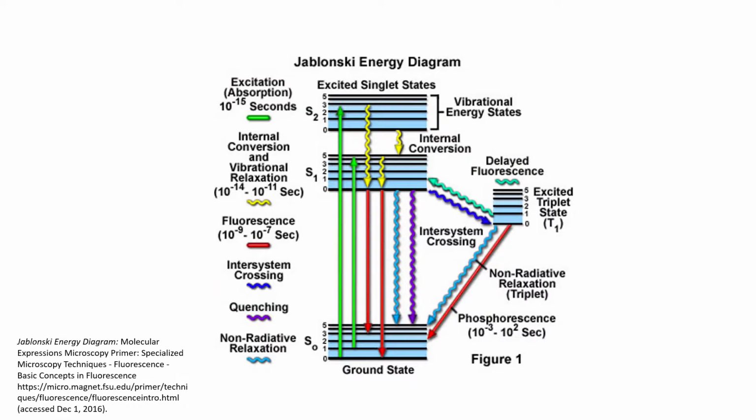A molecule's ability to fluoresce is a process of excitation and emission that occurs in 3 steps. We'll use a Jablonski energy diagram to walk through the process. The diagram is a representative figure of the electron activity during the excitation and emission steps. The first step is the excitation of a molecule by an incoming photon. This means the electrons are excited from the ground state to higher excited energy states.